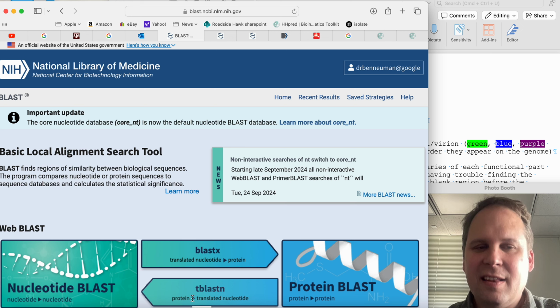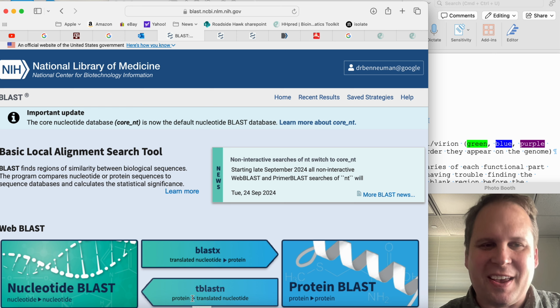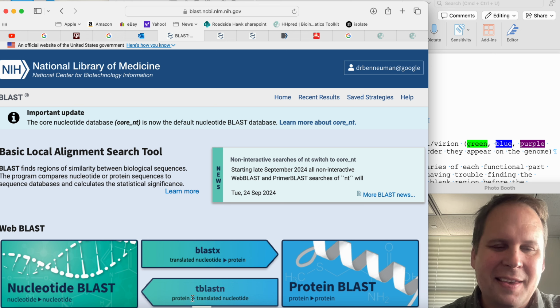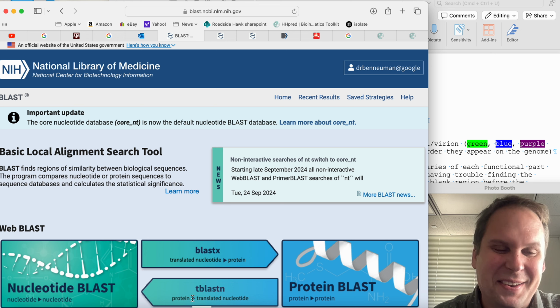Hi, let's go over what we were doing in this Find a Virus project, because I want to make sure that you get this. It doesn't matter that we're finding viruses. We can use these tools to find anything. We just happen to be finding viruses today because they're little and they're fairly easy to work with, compared to a bacterial genome, which may have 1,000 genes. The viruses we're talking about have maybe 6 to 8 genes. Not bad at all.